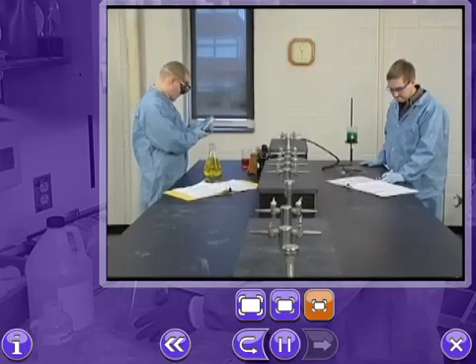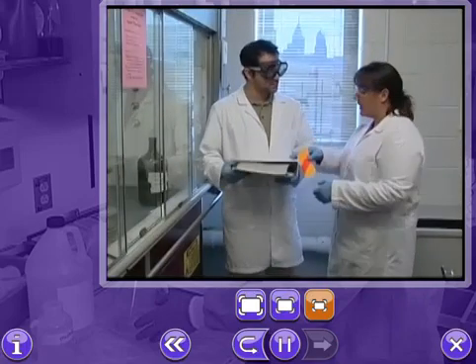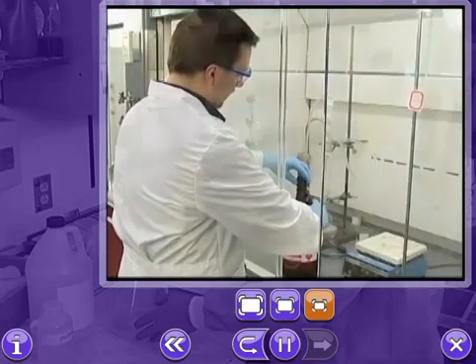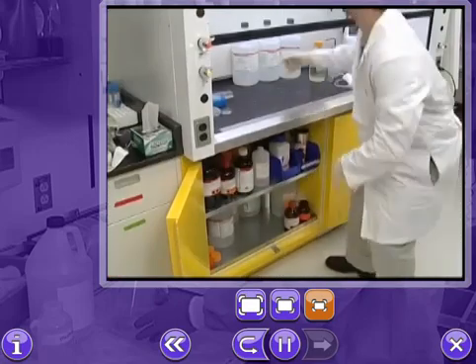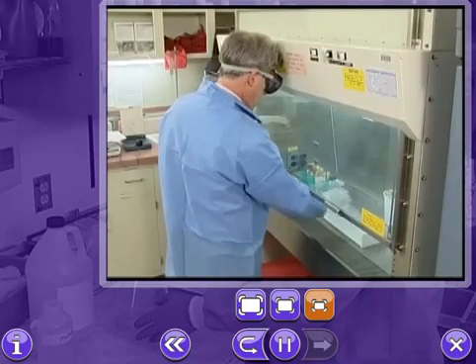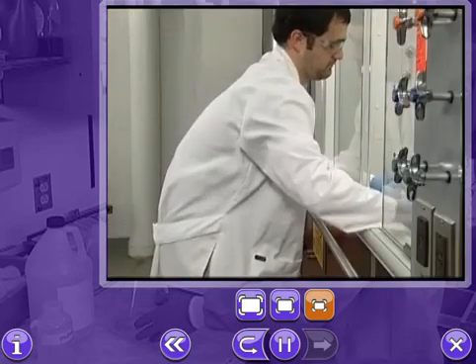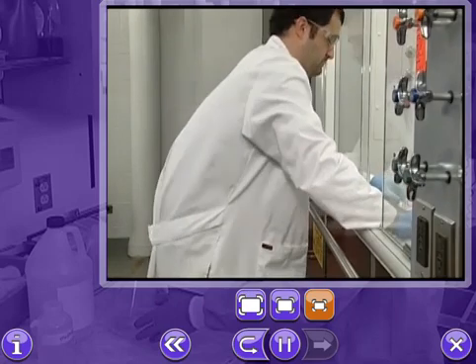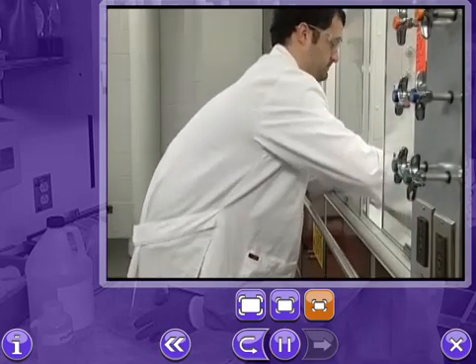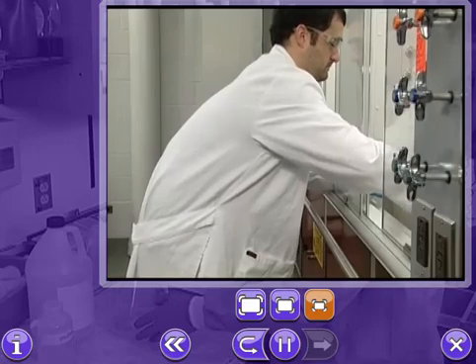Every week, we perform hundreds of different tasks in our laboratories. This work is performed at different workstations, using different instruments and materials, and employing different movements. As a result, each task makes a different set of demands on our bodies. If we aren't careful, some of them can lead to unhealthy stress or strain.